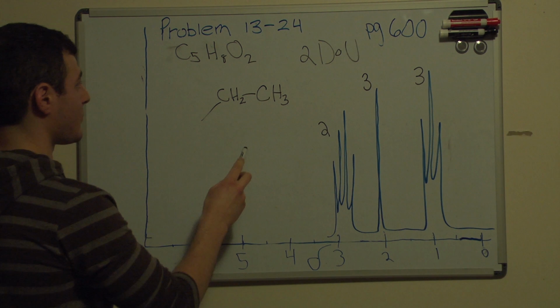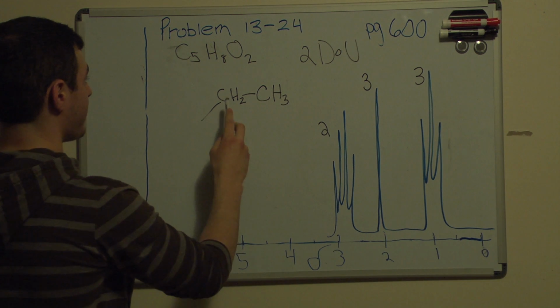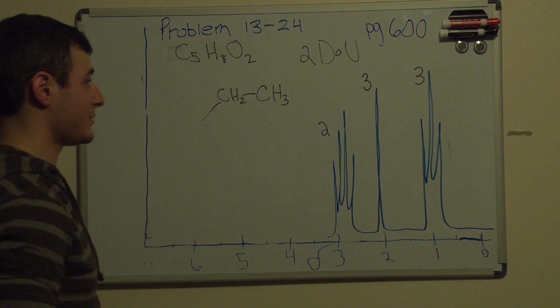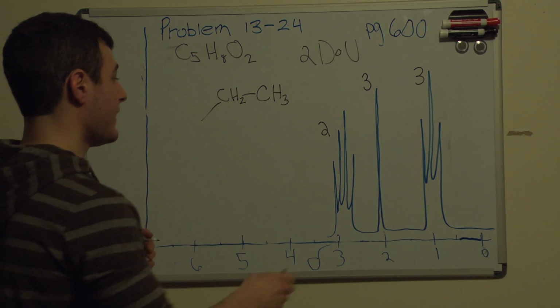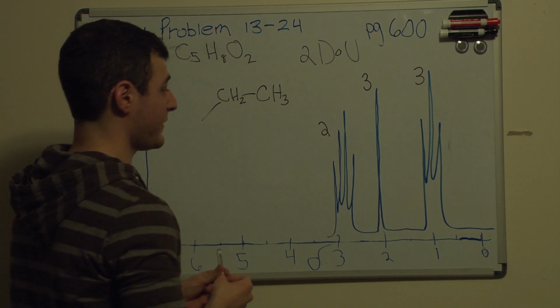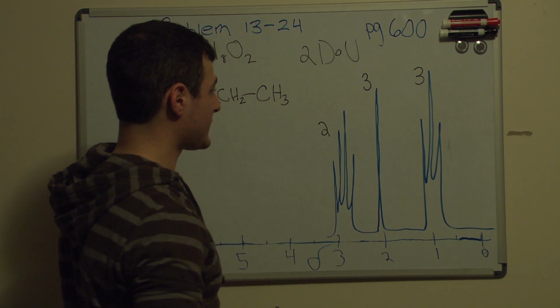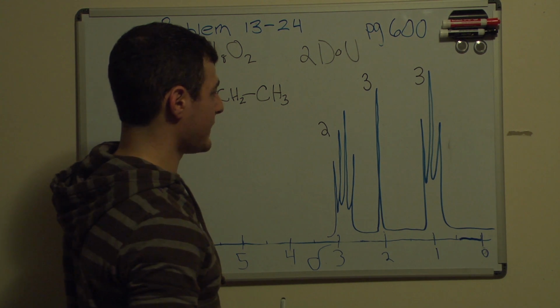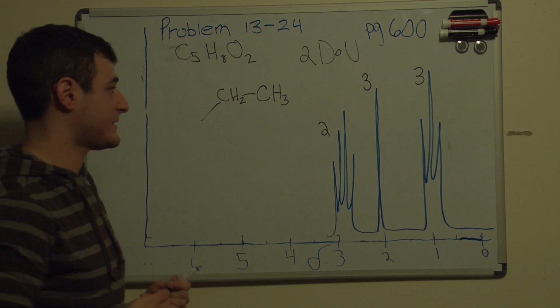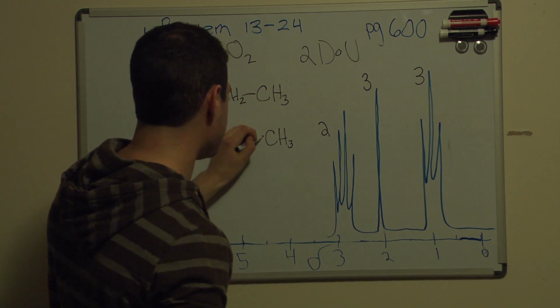Let me stop for a second and look where we are. So we took care of 2 of the carbons so far and 5 of the hydrogens. We still haven't included any oxygens yet or any degrees of unsaturation. I'm going to go ahead and look at this peak because I don't really know what to do next with the information we have. And this peak looks like it's a CH3 group, but it looks like it is isolated. It's not being split by any other hydrogens. So that said, I'm going to just draw it up here. CH3, and it's next to something.